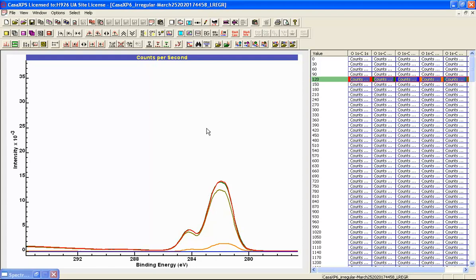And this is because the one doesn't entirely represent each one of these spectra, and if you include a shifted shape that is equivalent to the one that you're trying to fit, then the result is different from just fitting a single peak, and this makes a difference to the shape of the profile we'll ultimately generate.